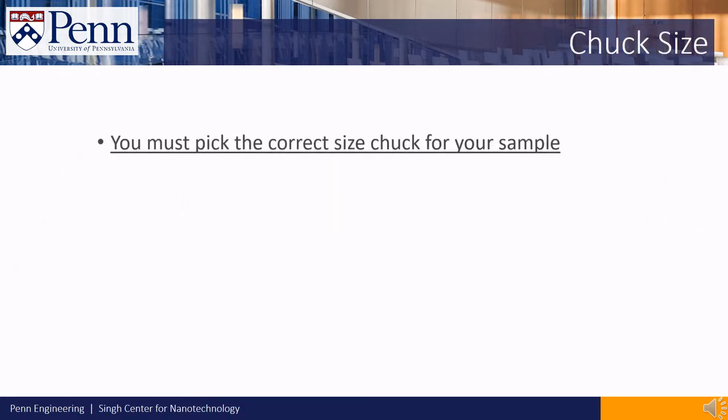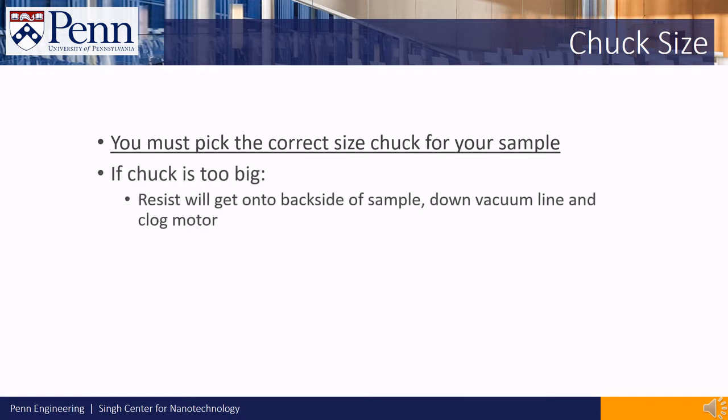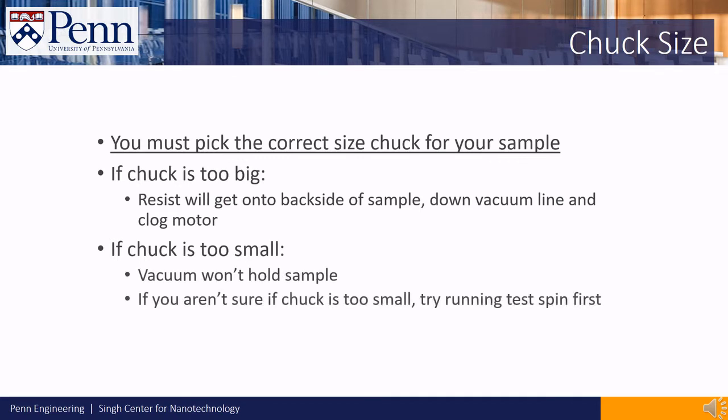You must pick the correct size chuck for your sample. If the chuck is too big, some of your resist will get onto the back side of your sample, down the vacuum line, and clog the vacuum line as well as the spinner motor. If the chuck is too small, the vacuum may not hold the sample well. If you aren't sure, you can try running a test spin with your sample to make sure the vacuum holds.